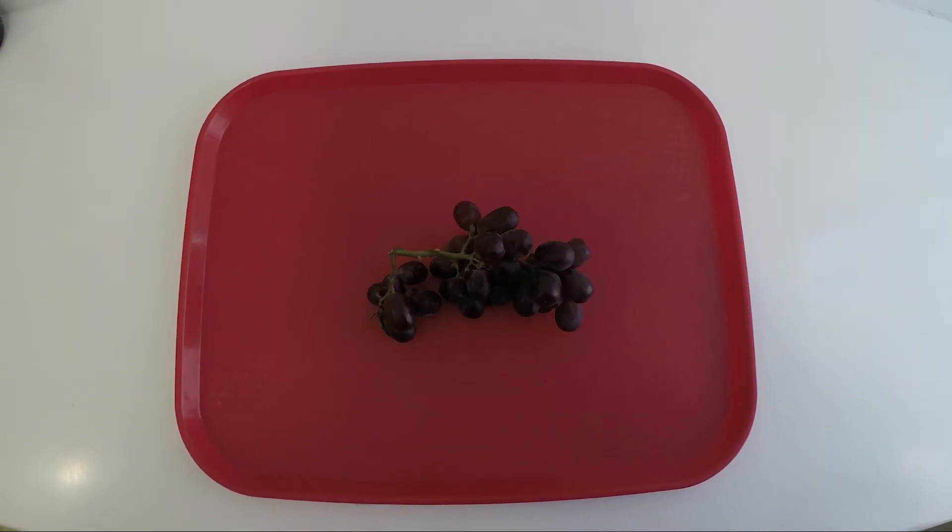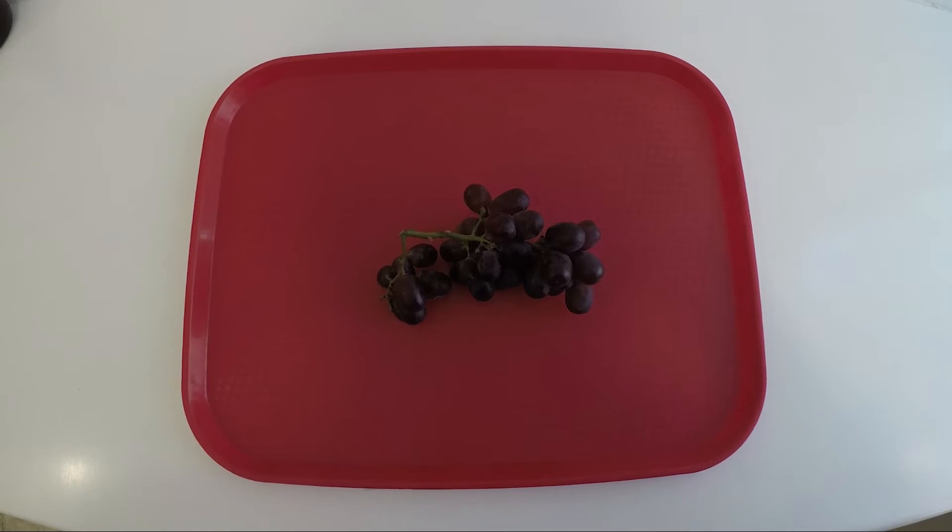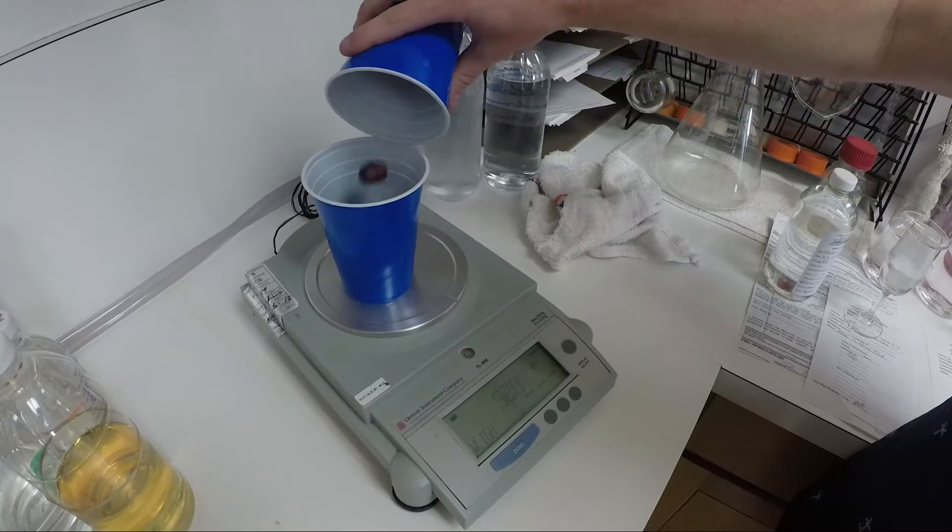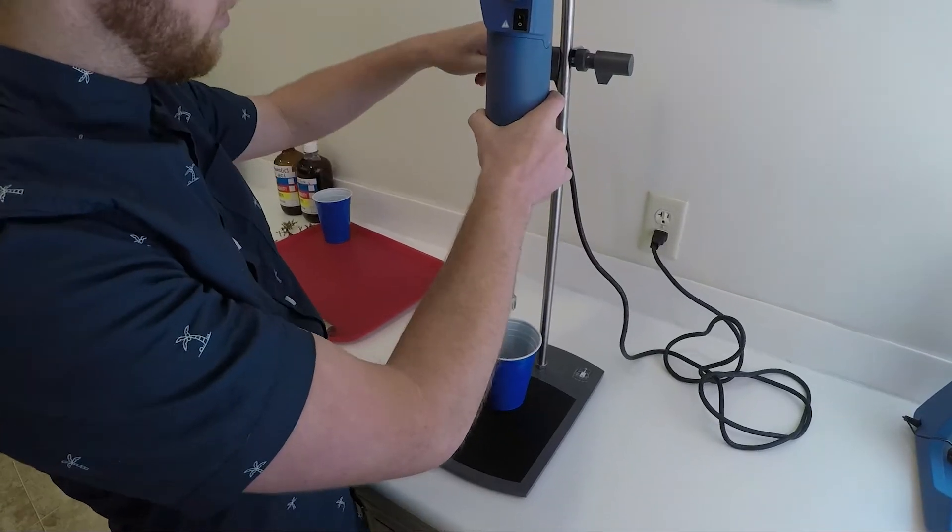Now that we have a representative sample of the entire block, we'll separate the berries from the rachis. We'll take the weight of our entire sample to find the average berry weight. Let's homogenize.